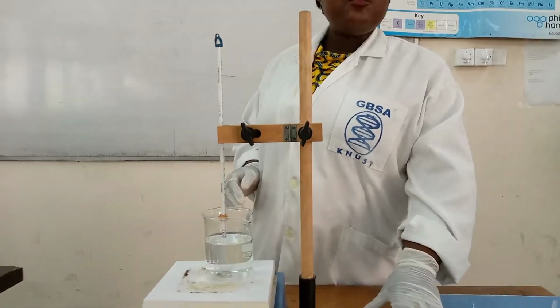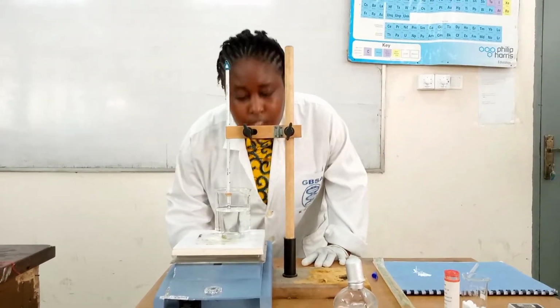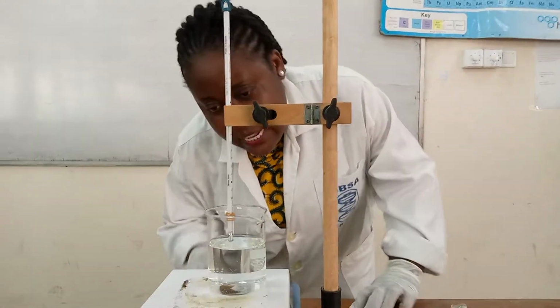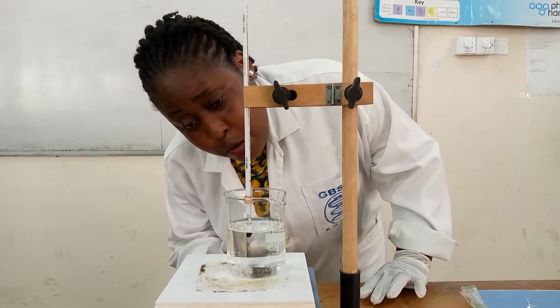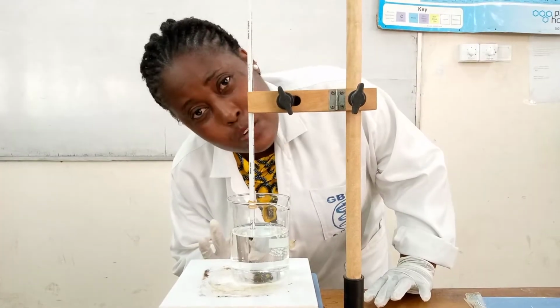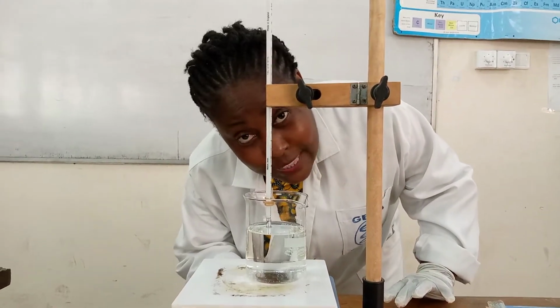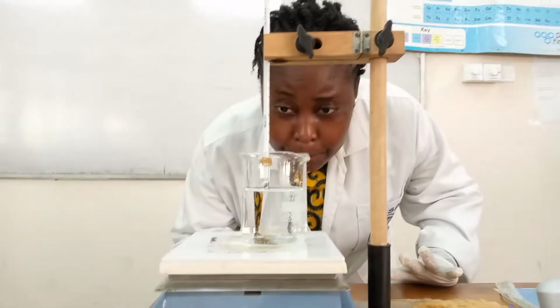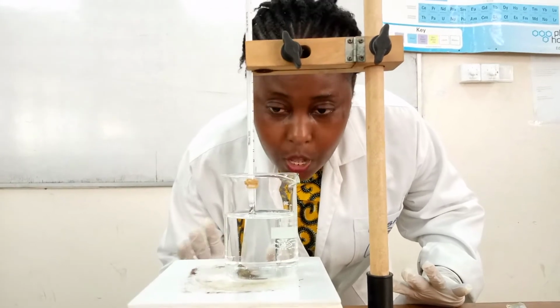So now we have to wait patiently. As we are waiting, you will be observing the sample in the tube. You have to observe. When you see that the bottom of the capillary tube begins, you see that there are bubbles coming out, like it's turning colorless. It means that it has started melting. So we record that temperature. And when everything in the tube becomes colorless, then it has finished melting. Then record that temperature also.